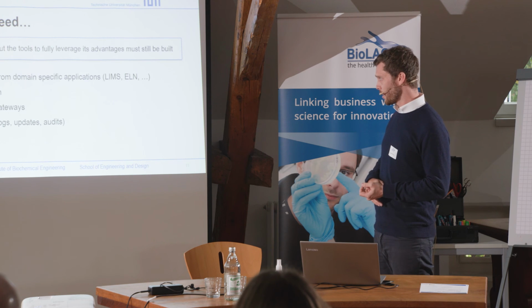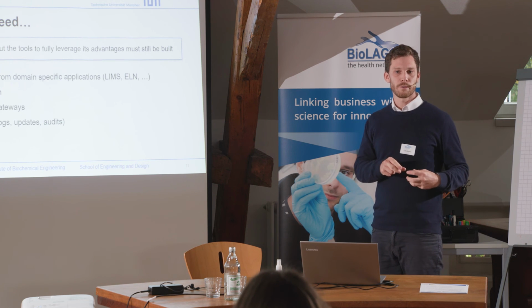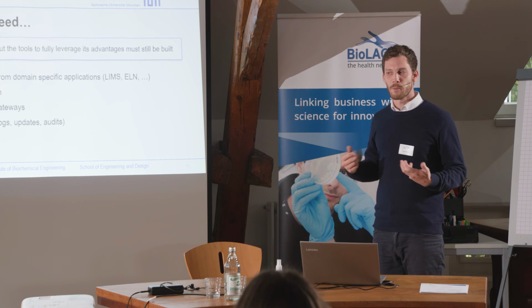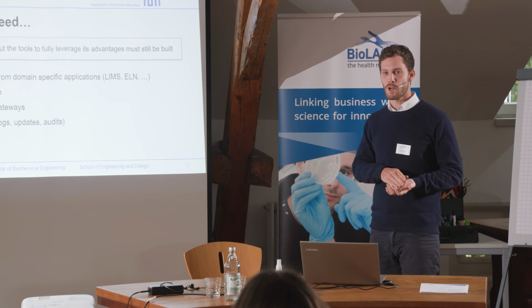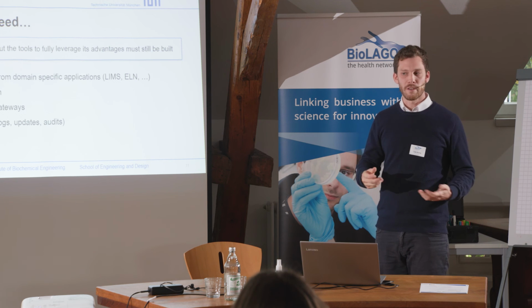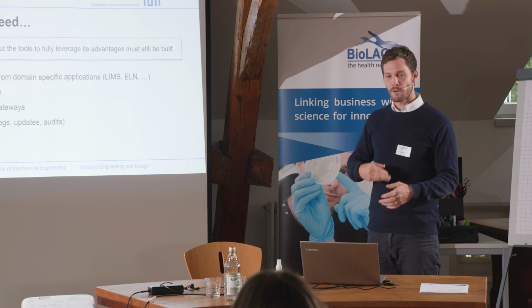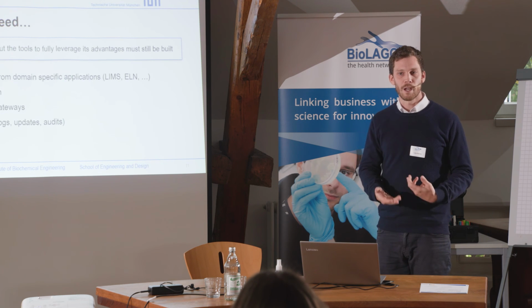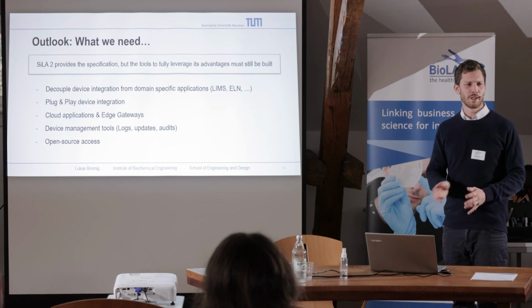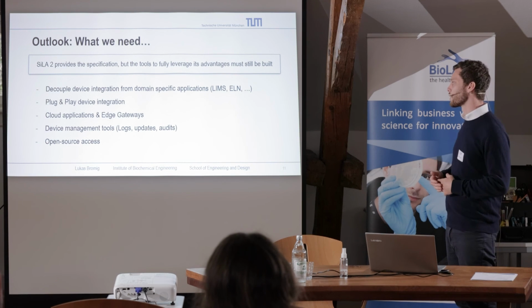And on top of that, what we're currently trying to do is also move all the software we wrote for SiLA completely into the cloud, so that we don't host that on premise anymore, because most of the people that we have don't really know how to maintain these things, and if the disk space runs low, then the data is lost and that sort of thing. So we're currently looking at that, and to enable that approach, we also rely on reliable, robust edge gateways, for example. We looked at it half a year or a year ago, and it didn't work because it wasn't possible with the edge gateway back then, and now we're going to try again.